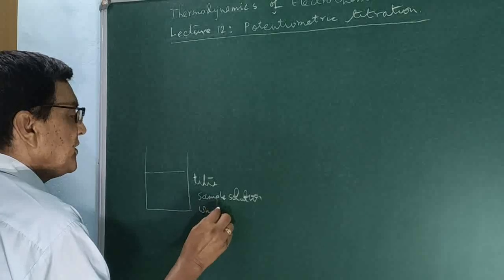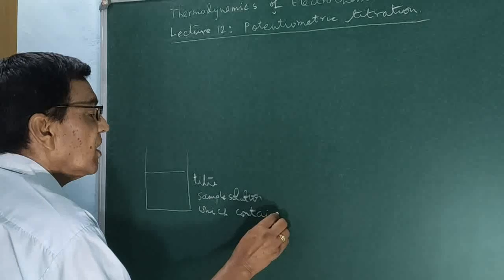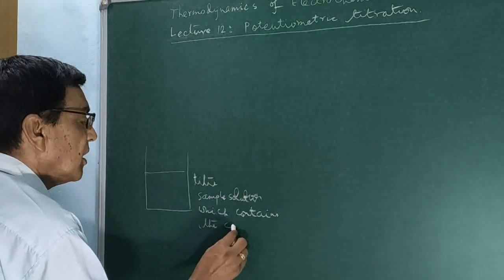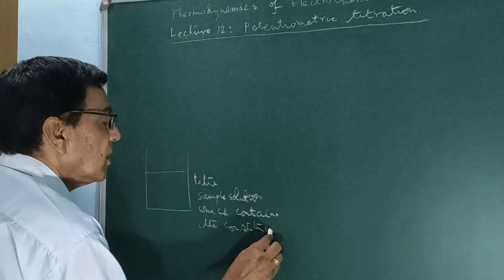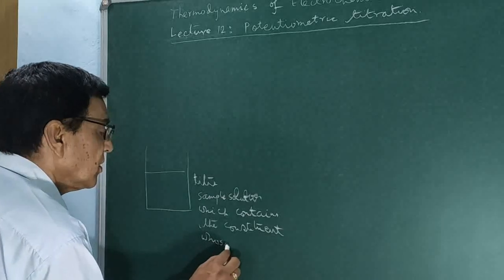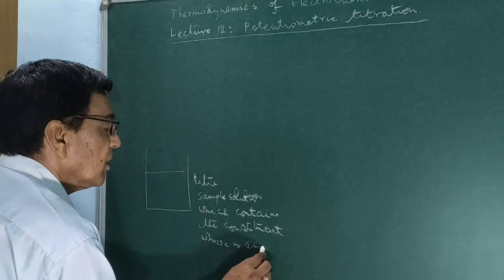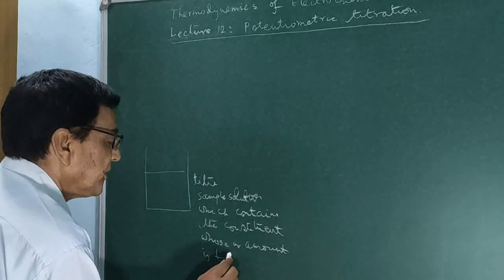which contains the constituent whose concentration or mass or amount is to be determined.